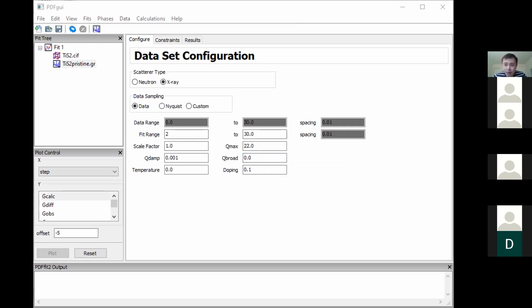Standard appears everywhere. It appears in our calibration of the distance in the 2D detector. It also appears here when we do the PDF fitting. In fact, if you do the exact fitting, there are also some parameters you want to fit against the model structure, which is also some kind of standard to get some of the fixed instrument parameters. So standard is important, and this is an example of its importance.